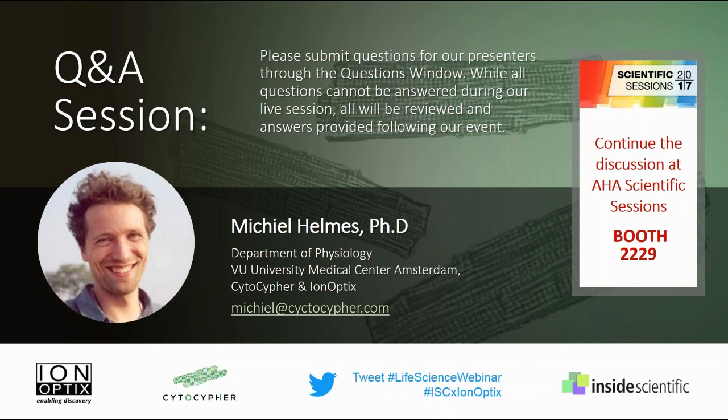Mm-hmm. I think your point... also, go ahead, Joe. Go ahead, Eddie. All right. I was going to say this also points to doing higher throughput, so that variability kind of goes out in the wash, and you can get more information, even with variability from myocytes. The more information you collect, the more you can make use of those cells.